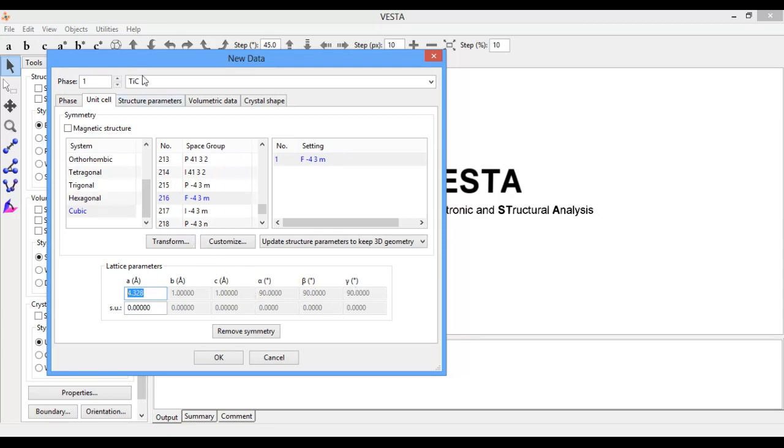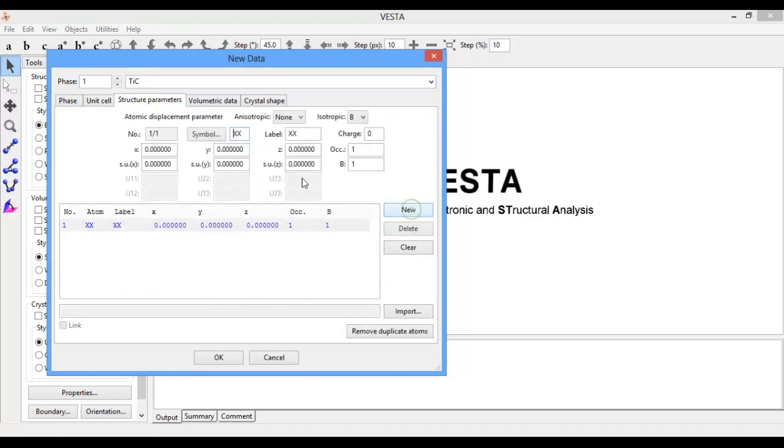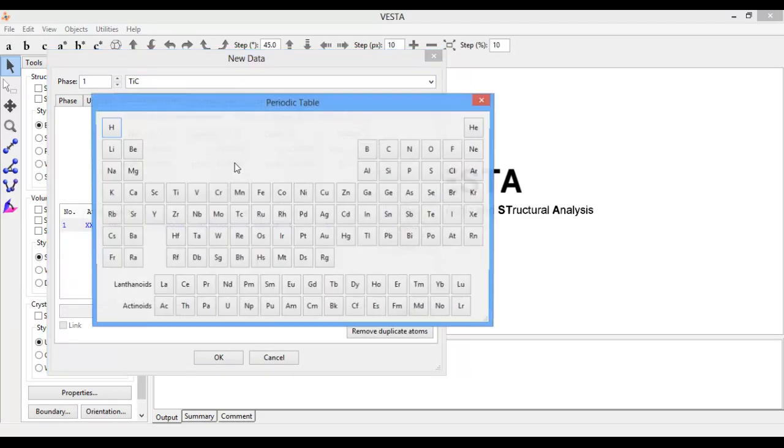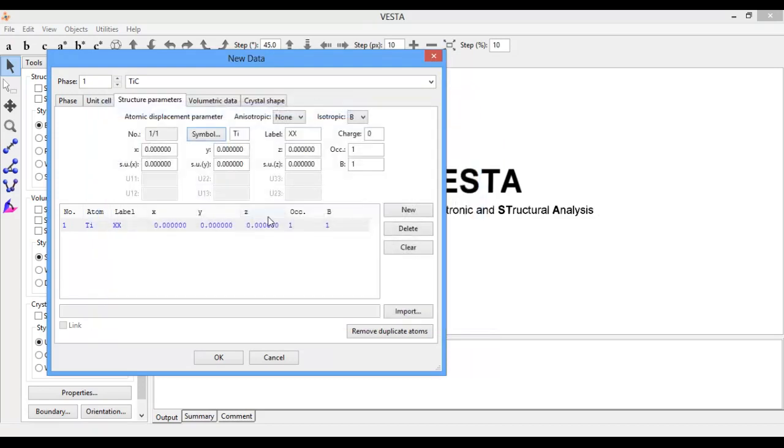Now go to Structure Parameter, click on New, select symbol Ti. Here I will position the titanium atom inside the unit cell.